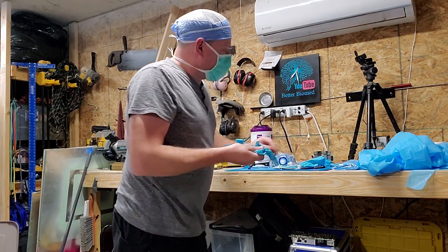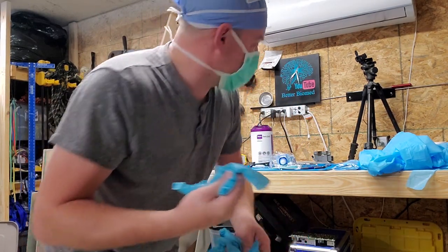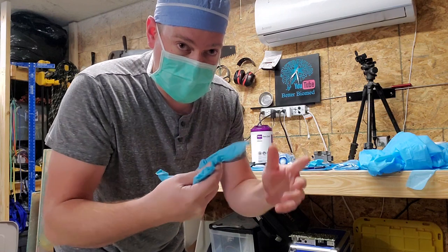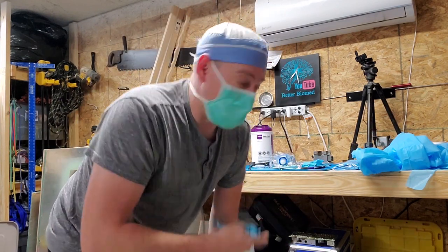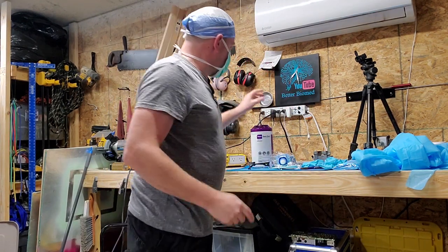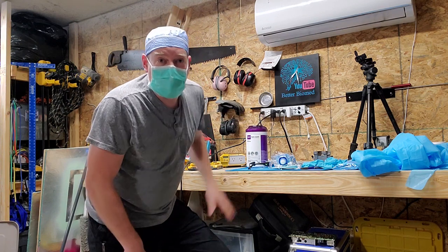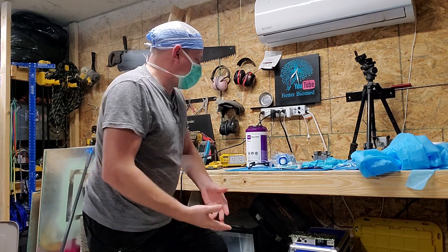You're going to need at least two pairs of gloves. The reason I say two pairs of gloves is because once you go in and you start donning this gear, you're going to want to have at least two pairs in case you break a set. You don't have to be fumbling around because you could make holes in your gown. So, two sets of gloves. You're going to need sani wipes. You're probably going to find them around the patient room or in the surgical ward. Sani wipes is in case you get something on you. You got to get it off first before you get your gear off.